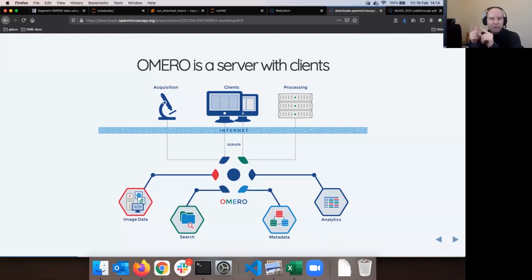The Ome team will only answer questions about problems here via the forum. And the institution is responsible, through its IT, for doing backups of the data stored inside the Omero server, because this is not automatic. The institution will have to think about how to bring on board the expertise of people who know what a server is, what a typical server is, and how to run it.